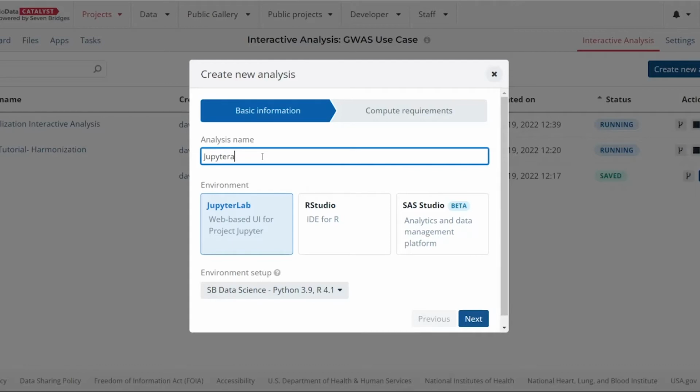Under each category, you have an environment setup. What's important about this is that there are libraries pre-installed. A lot of Bioconductor libraries, a lot of data science libraries are pre-installed, as well as, if you're going to get into machine learning, the drivers you need to run the libraries for TensorFlow, as well as the drivers to access the GPU. Okay, so we'll pick the default one, which is data science.